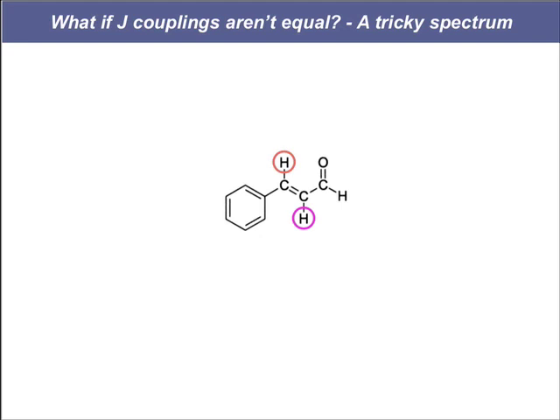But this is not a normal doublet because these relationships are not an sp3 hydrogen to an sp3 hydrogen. It's an sp2 hydrogen to an sp2 hydrogen. And in fact, those are trans. So we can look up on one of our slides the splitting constants for neighbors that are trans across a double bond.